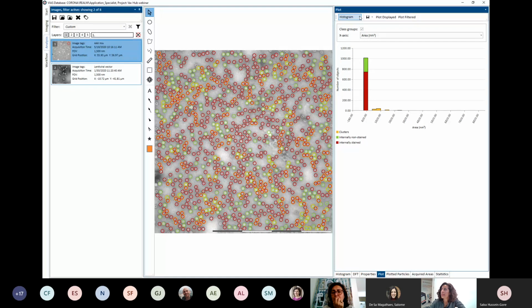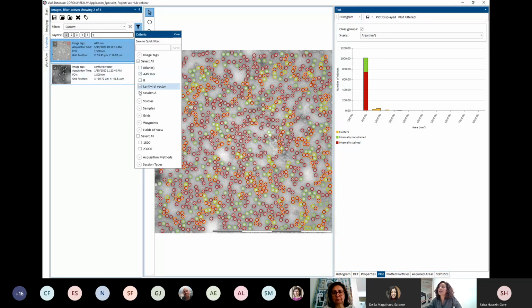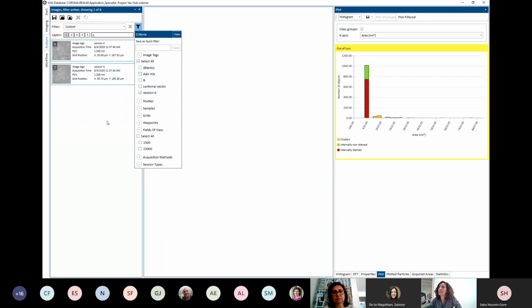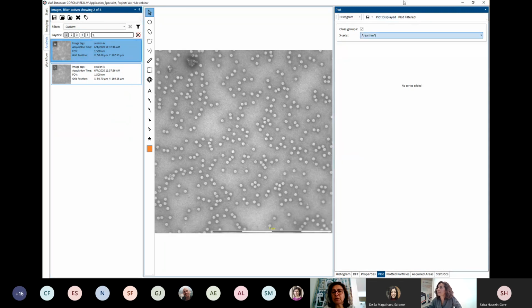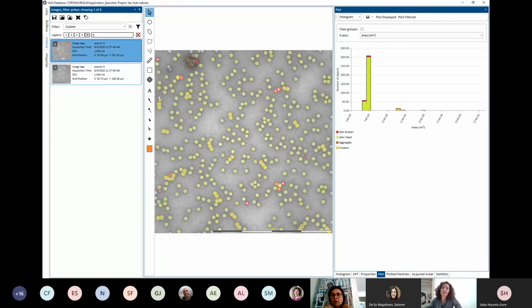The AAV. This one? No, go back to the very original, the AAV one, not lentiviral, the AAV. This is AAV, but I can show you. Yeah, let me go to that session A one, maybe. The ones that I had run the analysis on. Let's see. I don't know whether you saved it or not. Oh, I did. Hang on, it's here. There we go. What displayed? It saves it. It all stays in the project. So when you close the project, it won't let you close it without saving it.